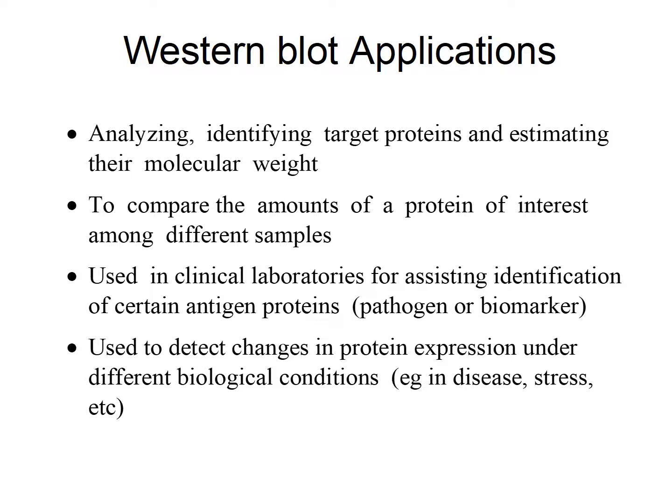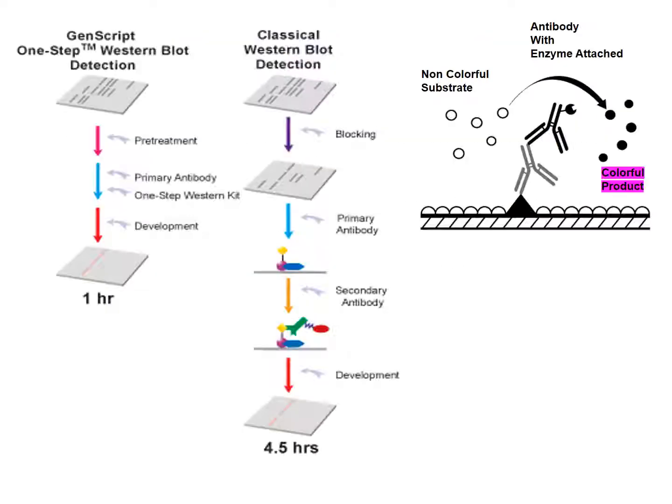Under certain conditions, we can look at proteins that will be highly or lowly expressed, and we can compare a disease, a stress, drug treatment, and see how the protein expression changes over time. And that can be key for understanding, say, a disease, okay, or a drug treatment. Here's just, looks like this company sells a GenScript one-step Western detection, and they're claiming this is an hour versus traditional 4.5 hours, like we've showed here.